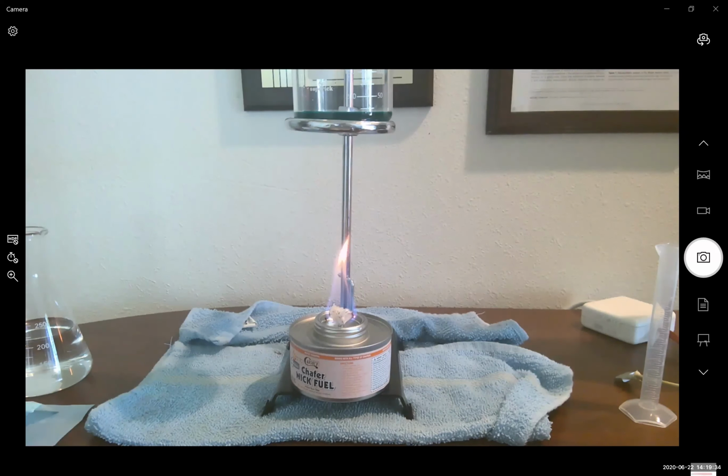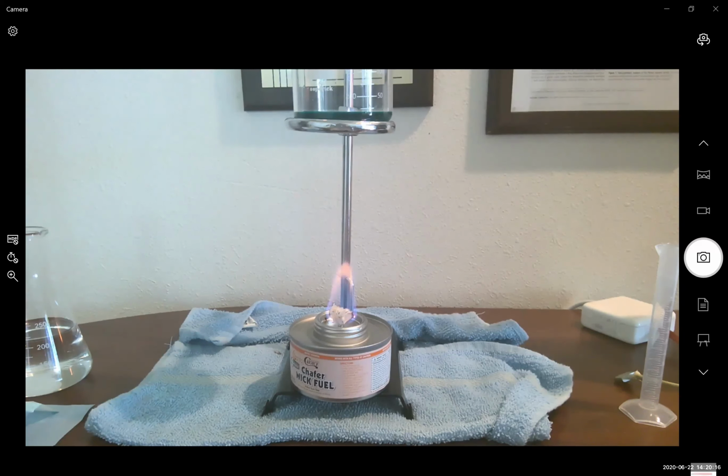In terms of subsequent steps that you're going to need to have prepared, you're going to need to get out your 50 ml beaker. This will just hold waste from this experiment, any extra water that we have, and this is where we're going to place any rinsing. We're also going to need another beaker that we'll use to carefully rinse our washers. We're going to need our aluminum cup that we haven't weighed the mass of just yet. Don't worry, if we need to take a mass measurement, we'll talk about that. And then we'll talk a little bit about how to dry our copper using the baking pan.